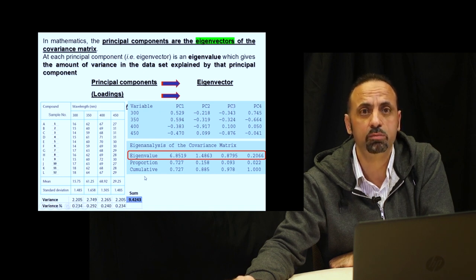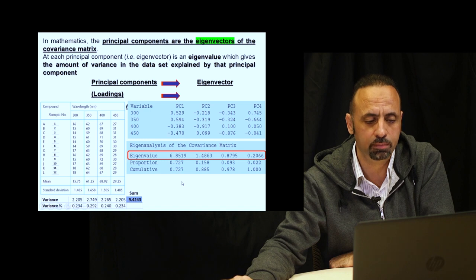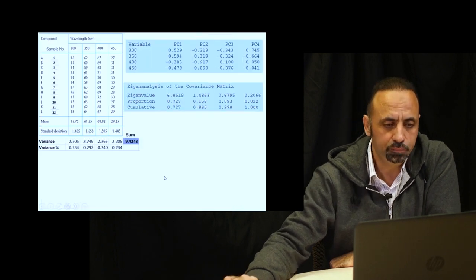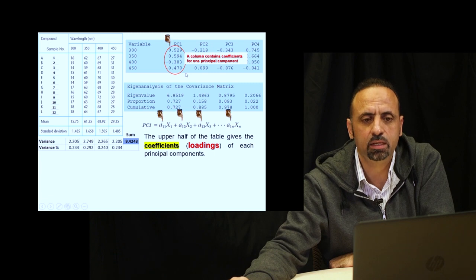And if you need a cumulative summation, you can see at the end we captured 100% of the variation. So if you sum all of these eigenvalues, it should equal 9.42 as the total variation.